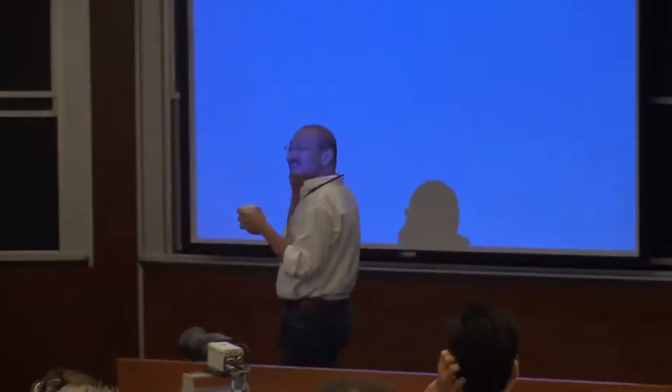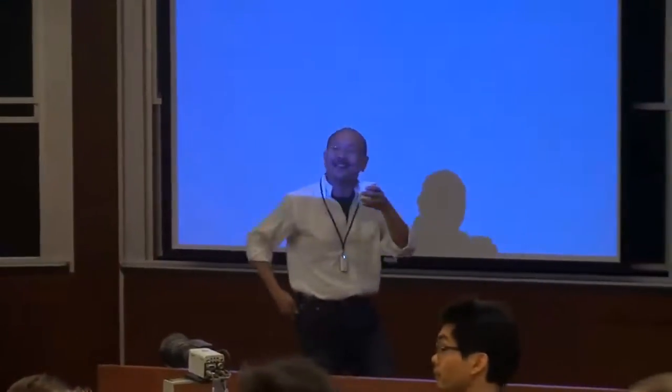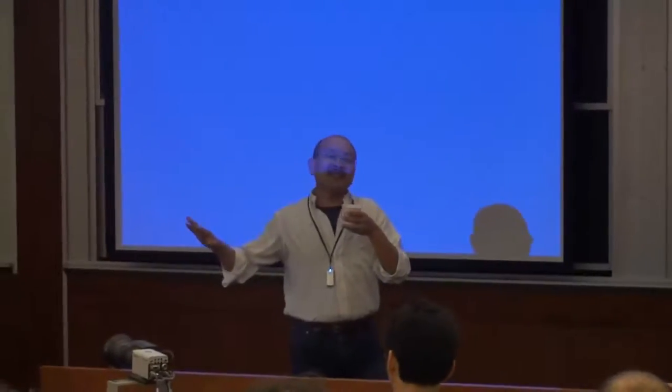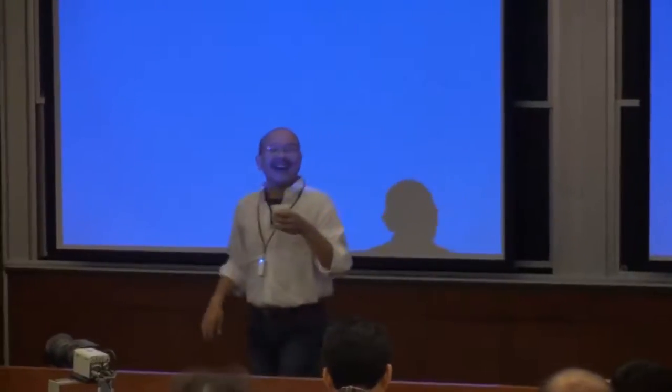So today, I guess it's a one-two punch. It's me and Dipan. Everyone knows Dipan too because he has been helping you for the last week and a half. And so I am going to tell you a few methods of doing 3D imaging based on very traditional methods of confocal and multiphoton and a little bit of second harmonic generation. This afternoon or tomorrow afternoon you would go into the lab and try some of those systems out. We'll show you how to push a few buttons to get it to work. You're not going to build that.